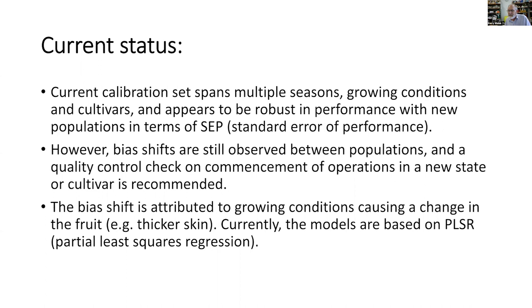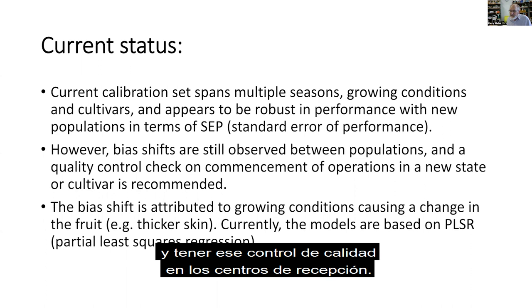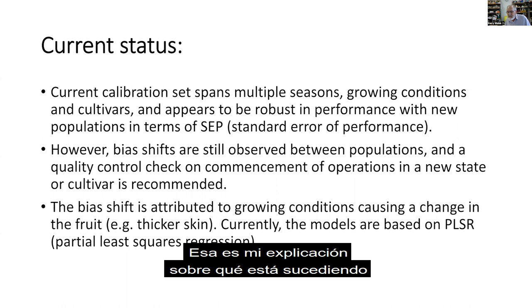It's good enough for the purpose, that is, judging when to harvest, basically, and having that quality control at the receival centres. We do get some bias shifts between populations. I put that down to this being an optical method, and light has to get in through the skin. We're measuring the flesh, so it has to get out through the skin. So I think in some varieties or some growing conditions, something happens with the skin. The skin is thicker or whatever. So that's my explanation for what's happening when sometimes we see a bias shift.